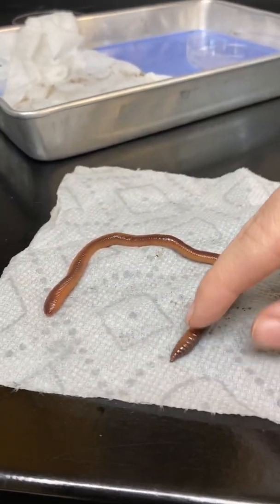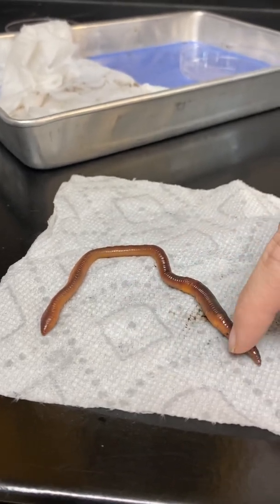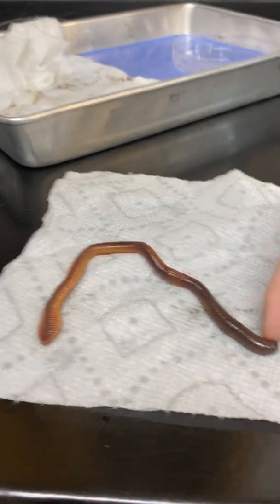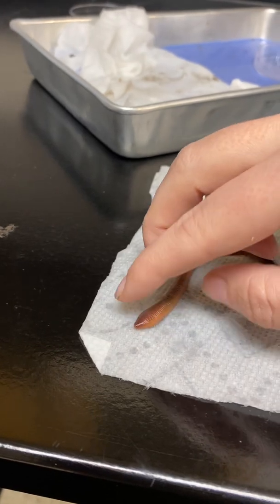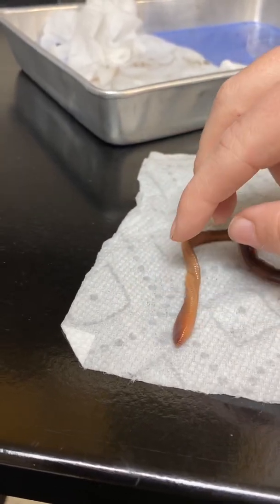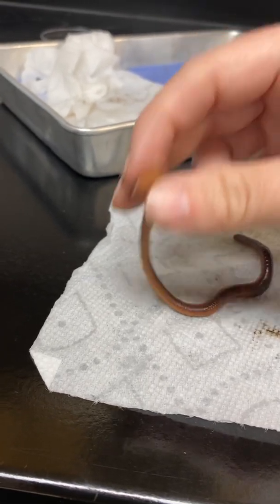I'd say that it just kind of contracts and kind of just moves more whenever I start. For the anterior end, when I touch the anterior end, it just doesn't really pull away, but it just starts moving a lot more. It becomes a lot more active. The posterior end, nothing really happens, so not much movement.